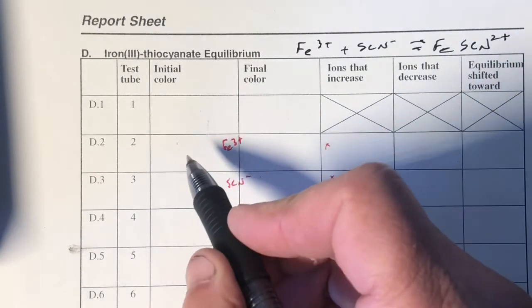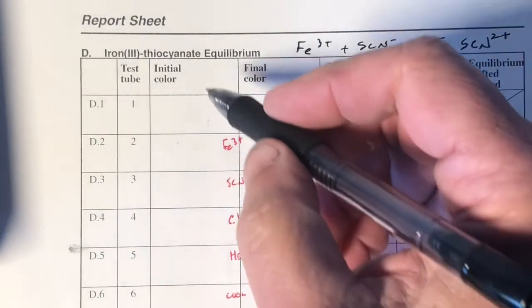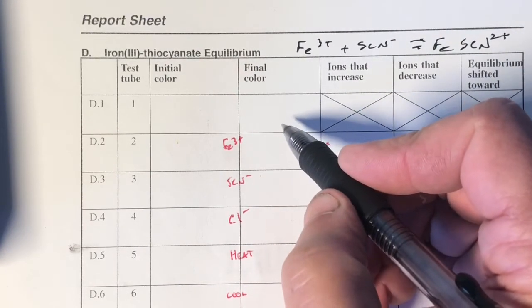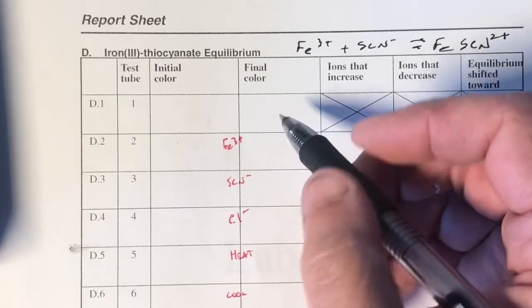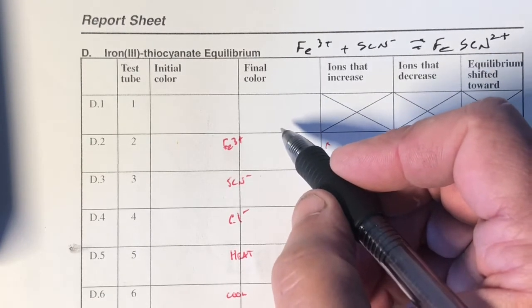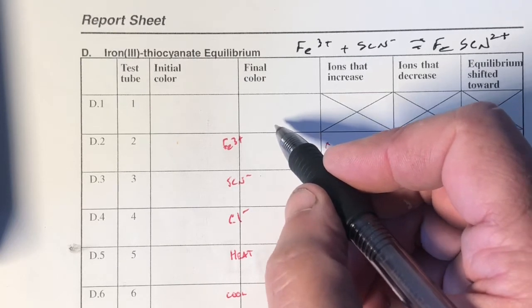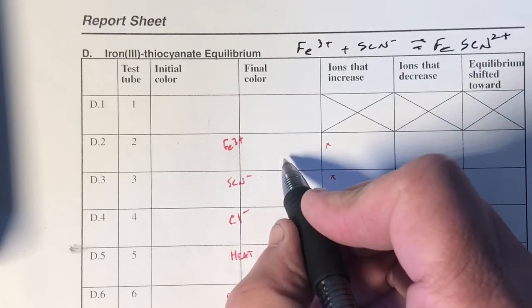So these initial colors, we might just say red, red, red the whole way down. So those are all the same, and that's what's key. And then the final color is after we've done anything. In step 1, we just add a little bit of water, so nothing really happens. If you had really good eyes, you might see a slightly less intense solution, less intense color, but it's a pretty subtle difference. All right, when we add iron, we go from red to dark red.